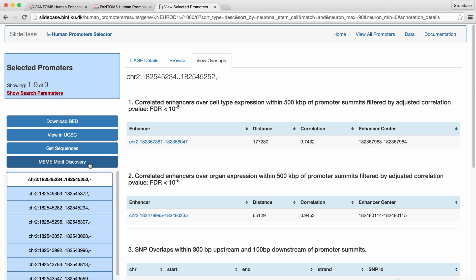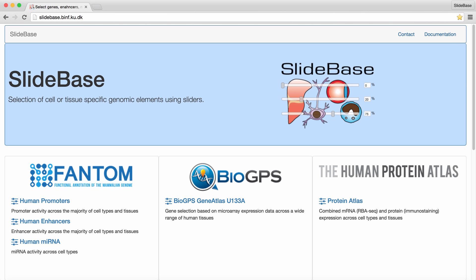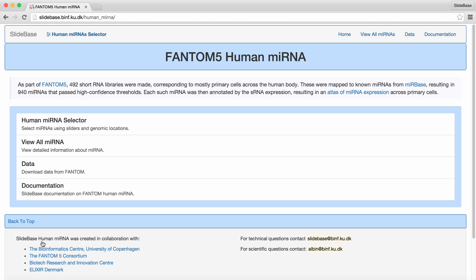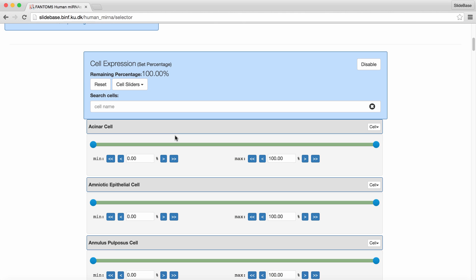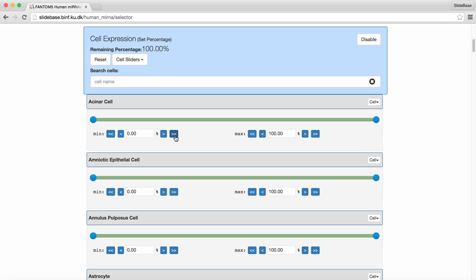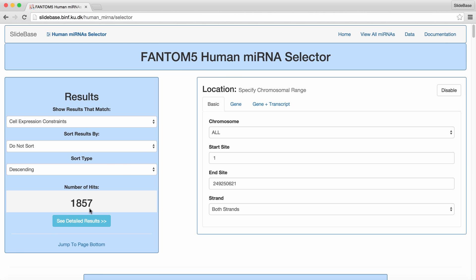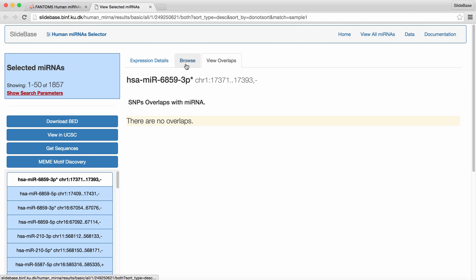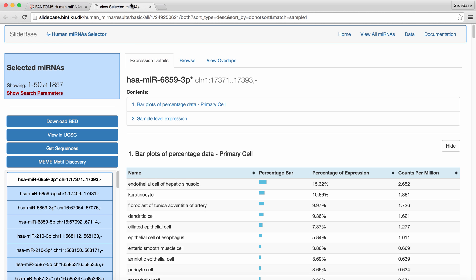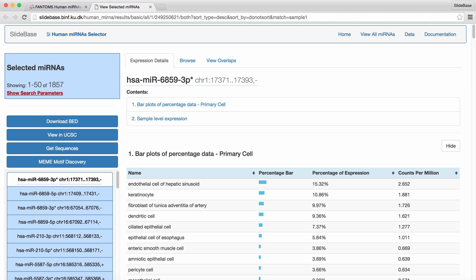Next, we will briefly show the other three resources. From the main Slidebase homepage, we can navigate to the Human MicroRNA selector, Human Gene Selector from BioGPS, and the Gene Selector from the Human Protein Atlas. The Human MicroRNA search page is structured in the same way as the Human Promoter selector, with the difference being that there is a single slider group which only contains primary cell samples. The Human MicroRNA viewer page displays similar structure and functionality to the Human Promoter's. A notable difference is that the MicroRNA list contains name-location identifiers for each microRNA, rather than just the location-based name.